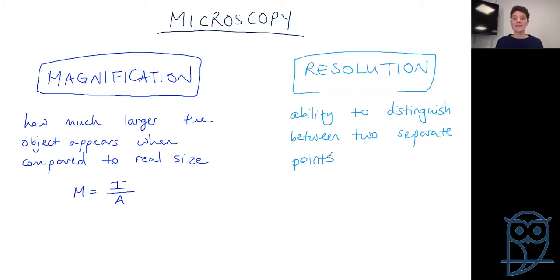Nowadays, with our lovely new technology, you can zoom in an awfully long way before things get fuzzy. But with the earlier digital cameras, you reached a point quite quickly where you zoomed in and things were fuzzy. So we've lost the resolution. Our pixels are not fine enough to give us the detail of the image. So magnification is zooming in, resolution is picking up the details.